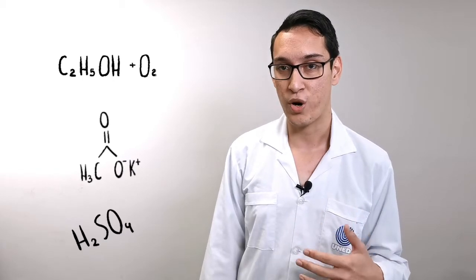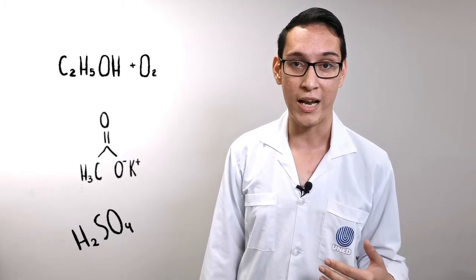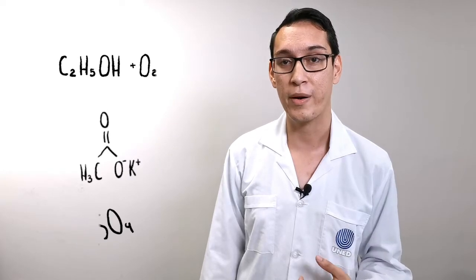Titration is carried out by the slow addition of the titrant from a burette to a known volume of the analyte solution until the reaction reaches a chemical neutralization between the analyte and the standard substance. This is called the equivalence point, and it is a theoretical value that cannot be determined experimentally.